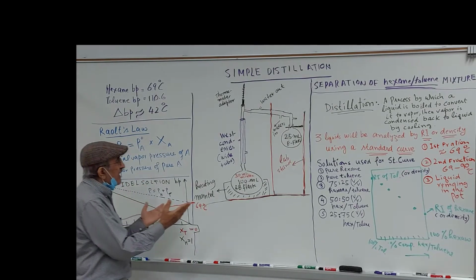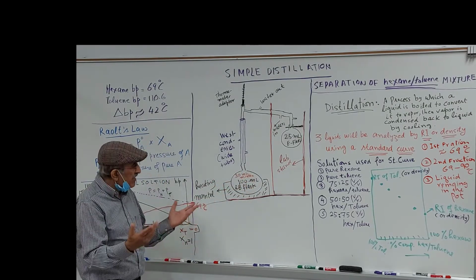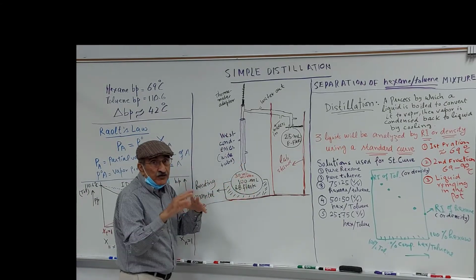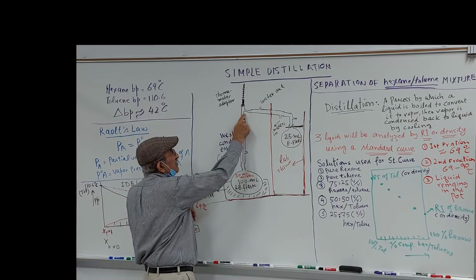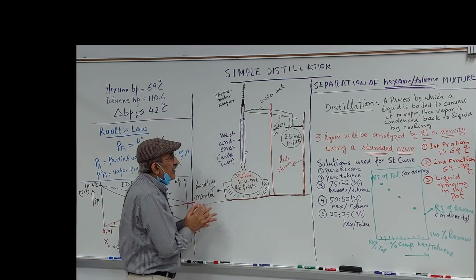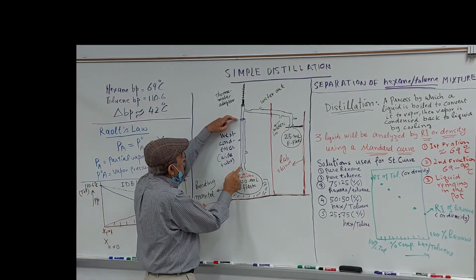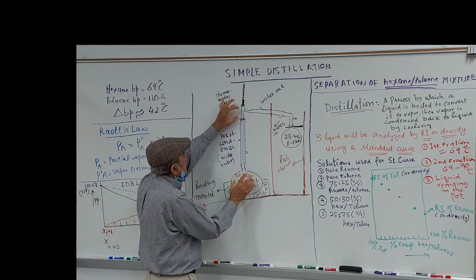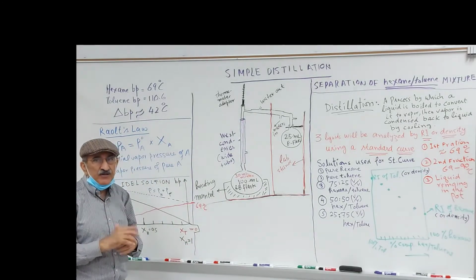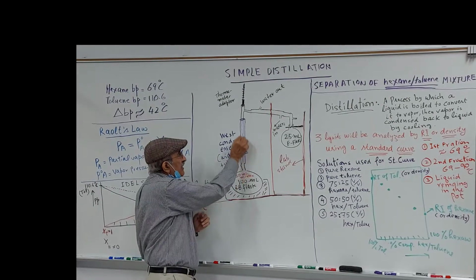Now the manual says that you take a 100 ml RB flask. RB means round bottom flask. Yeah, we are taking this round bottom flask, and according to the manual, you take this distillation adapter and you join it directly here. But my experience is that if you interpose another condenser between the round bottom flask and the distillation head, you have two condensers in the kit. Now you use the one that has a bigger inner channel.